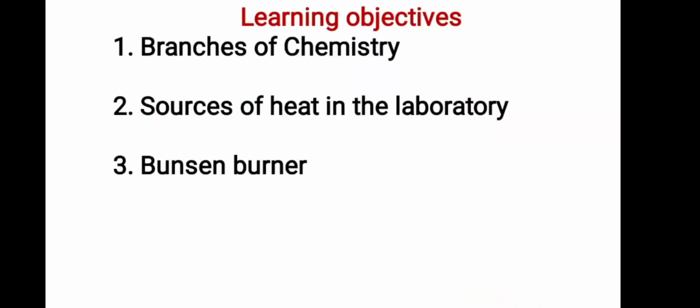Welcome to the class of chemistry, the second lesson after the introduction. Today we will be looking at mainly three things. One, we'll be looking at the branches of chemistry. Secondly, we'll be looking at the sources of heat in the laboratory. And then thirdly, we will look at the Bunsen burner.